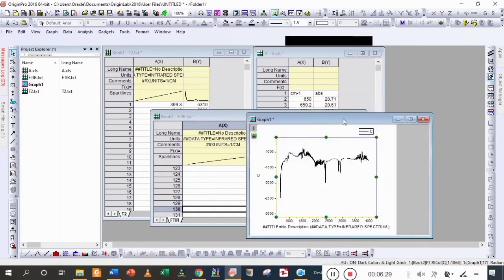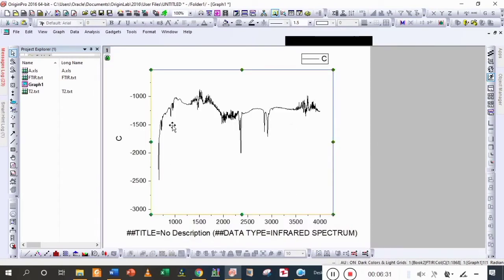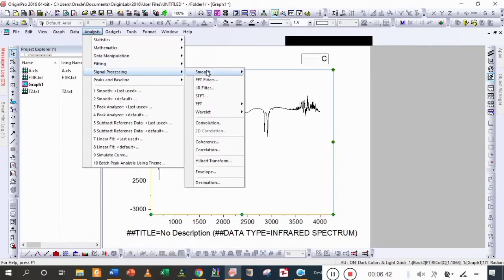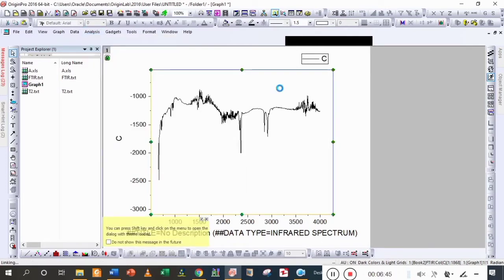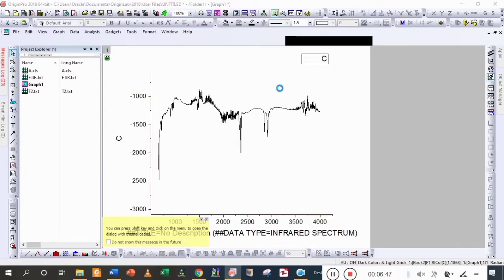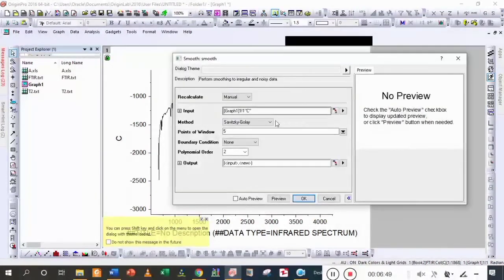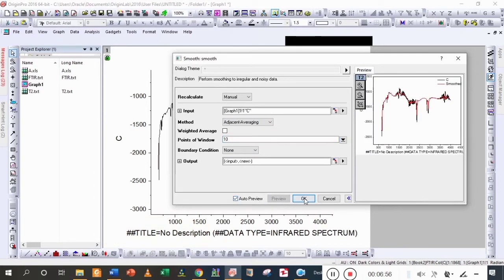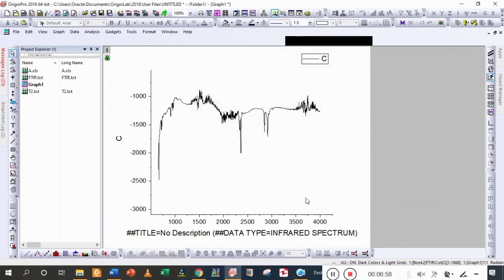You can see that there is a lot of noisy data, so we are going to remove it using a smooth filter. You can check this smooth filter process in our other video. Here we open the smooth dialog and then choose the adjacent value — it is used to make an average. Then preview, select points.